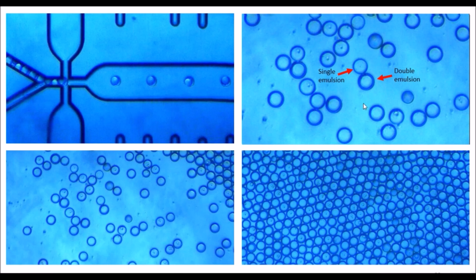And upon collection, you can view this very easily on a glass slide. So I've just collected them on a glass slide, and you can see there's a nice ring there. There's lots of double emulsions. On the odd occasion, you might see a single emulsion. What that basically means is when the primary drop hasn't been encapsulated and you just simply have the spacer fluid and the TBST making a drop. So that's what I mean by single emulsion. This is typically what it looks like, and it's very monodispersed, and it's quite compatible with a standard FACS machine.